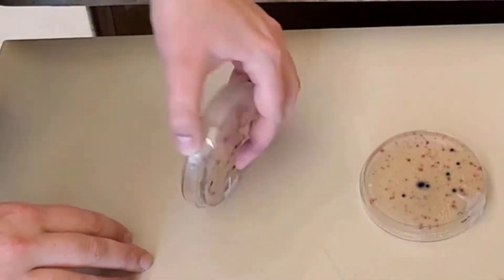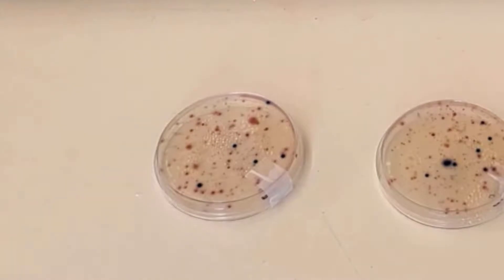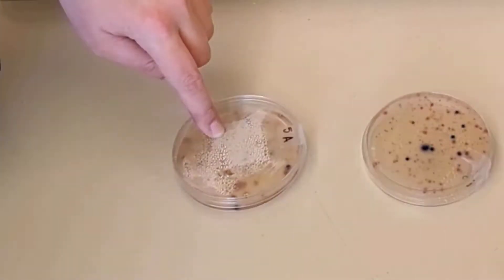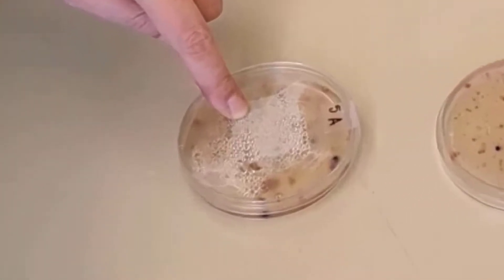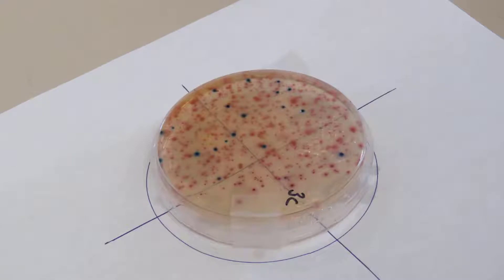Before you count the colonies, flip the plates upside down so that you are counting colonies through the bottom of the plate. If you do not flip, you will find that a layer of condensation has most likely formed on the underside of the plate's lid, which will make it difficult to see the colonies. You should also place the plate on top of a white surface, such as a piece of paper, so that you can see the colonies and their colors more clearly.